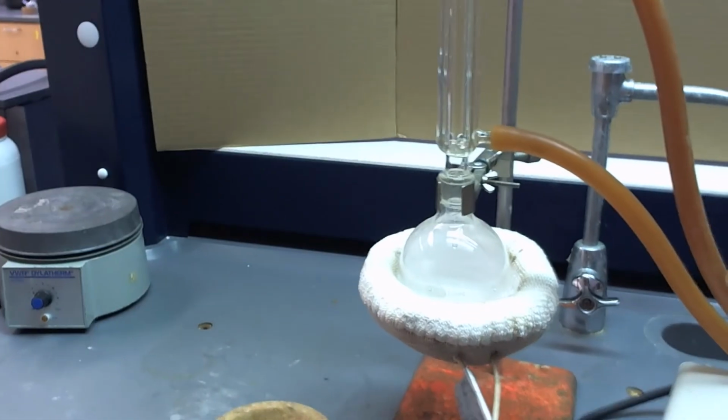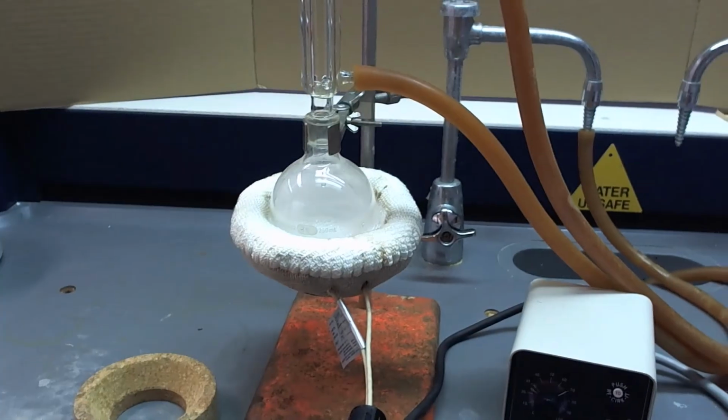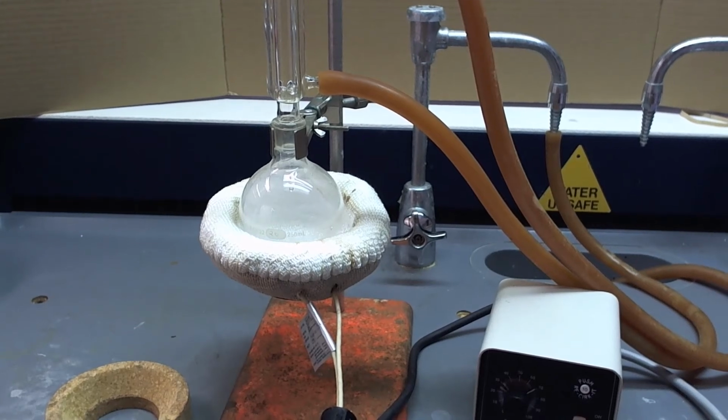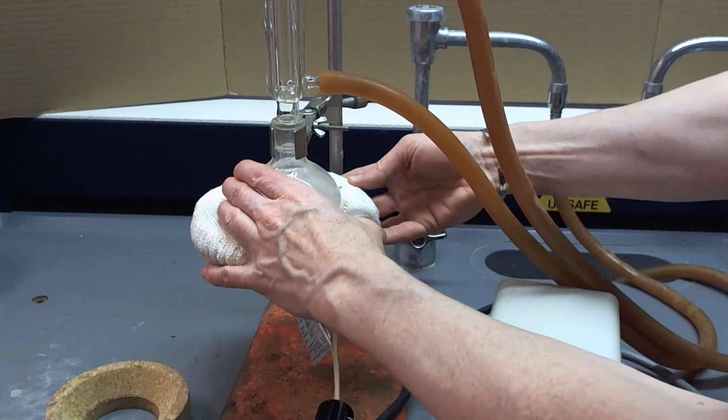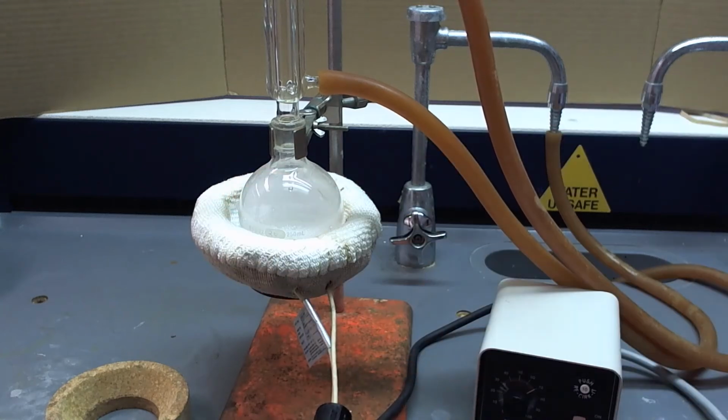All right, now we're going to get this guy heating. It takes a little while. The better the contact between the flask and the heating mantle, the faster the heating process will be.